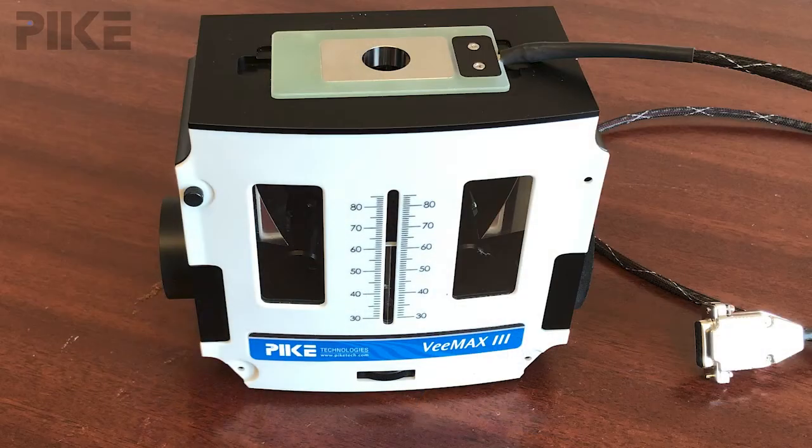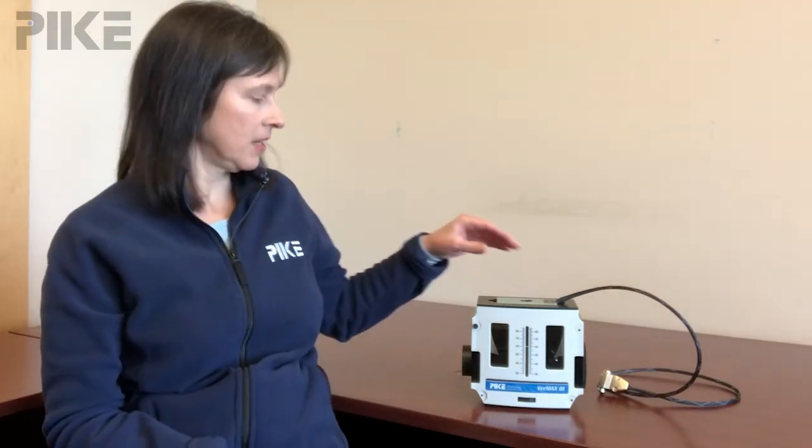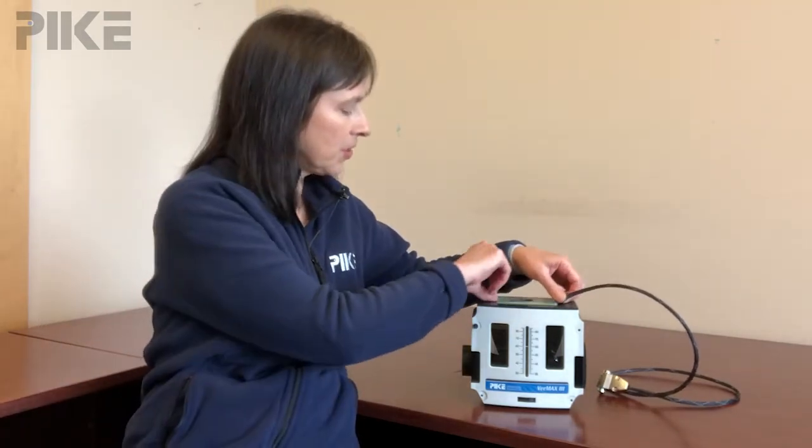I have the VMAX variable angle specular accessory with me today, and if you need heating, a really easy way to configure your VMAX is to purchase a heated insert.